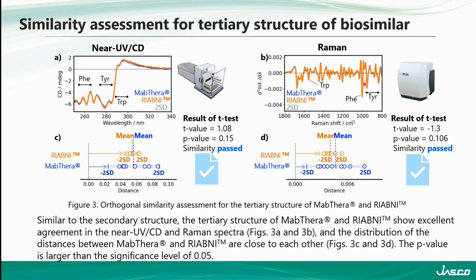And here I'd also like to highlight that, personally, I have some experience with Raman, but not too much. So if I was looking at this data set, I would not be at odds with determining whether this is significant, because a lot of this looks almost like noise. But it's nice to be able to run this through the qHOS. It gives you these defined values. And then the distance curve here really helps simplify a lot of the complex spectral information that's hidden in this spectrum up here by displaying it in a very simplified manner.